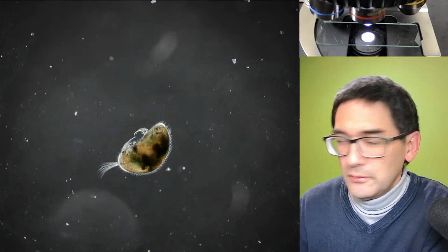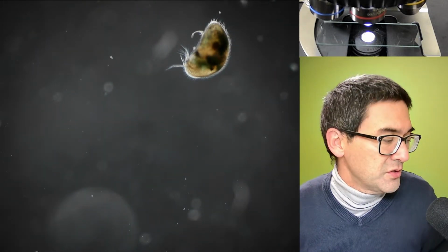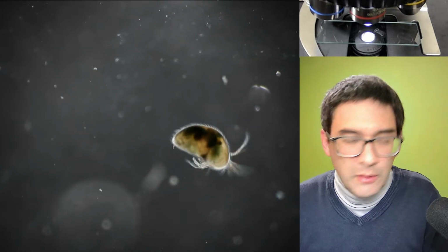The guy stopped moving. Why did he stop moving? Sometimes they stop moving if there's too little water present. But I mean, you still see a little bit of movement here. Let's add a little more water. Maybe it's kind of sensing that there's too little water. Here we go again. Okay, so now to the chili.